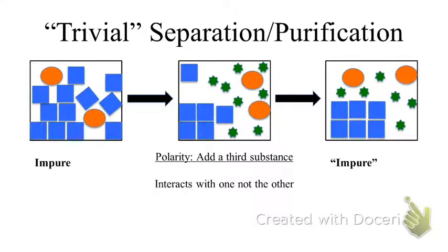So what we're trying to do is to take advantage of that solubility. I know it sounds ridiculously simple. That's because in theory it kind of is. The technique is entirely different. That only allows us to go based on one particular circumstance. We'd have to find a solvent that completely dissolves only one of our compounds but not the other. That's a little bit tricky.